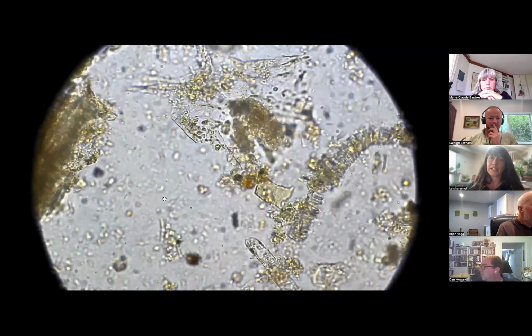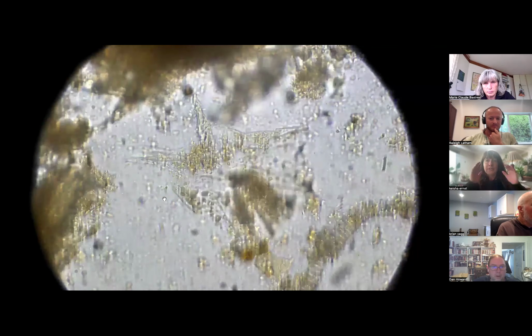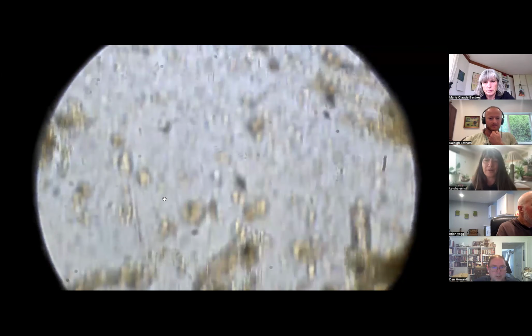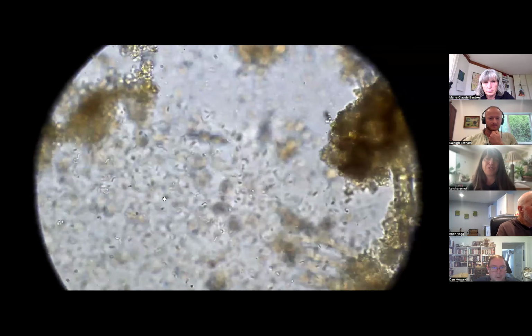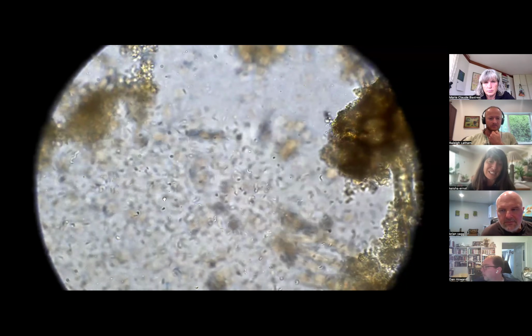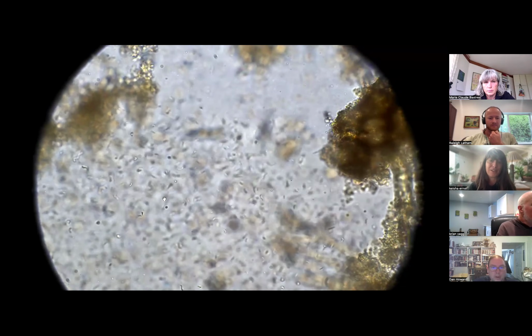The truth is there's not a lot of research to figure out exactly all these different species of spirilla and spirochetes and which ones are dangerous and which ones aren't. What we know for a fact is there are species in both of those categories that can hurt or kill people or animals. Since we can't tell who this is exactly, we need to wash our hands, especially because of the amount.